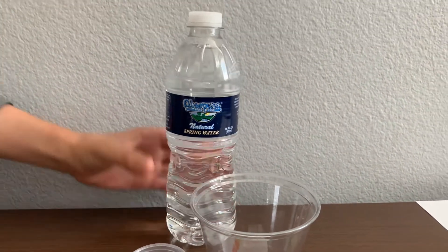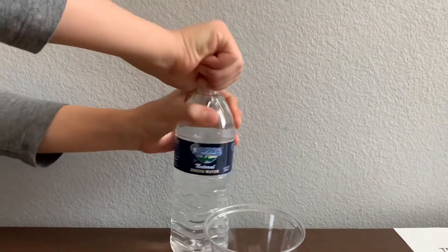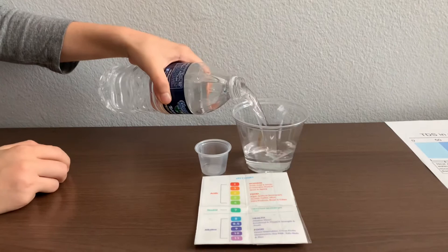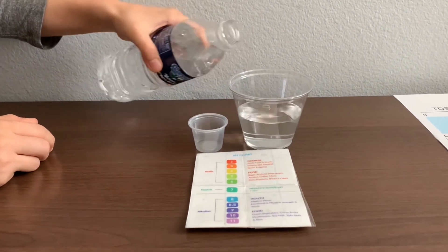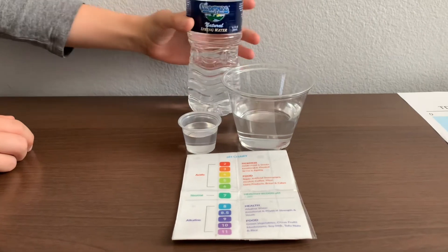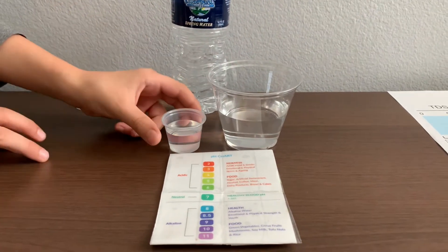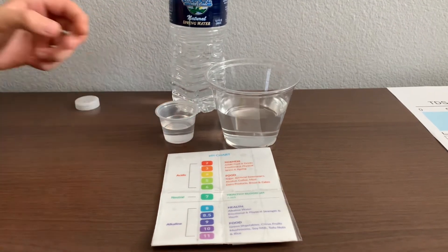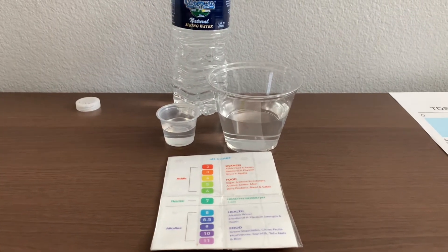Let's test the pH and TDS levels. Let's pour some water in. This is too much for the pH cup, so let's pour some back into the TDS. First, let's test the TDS level.